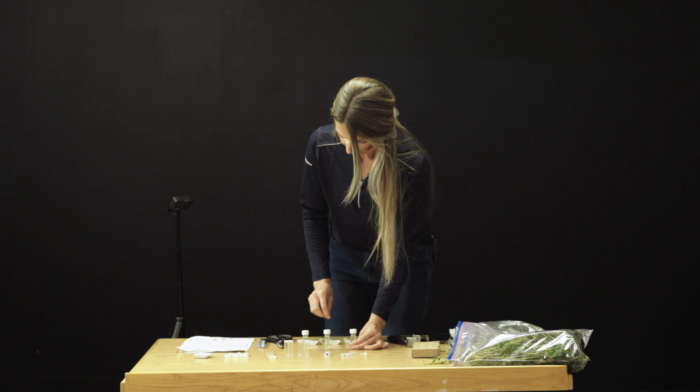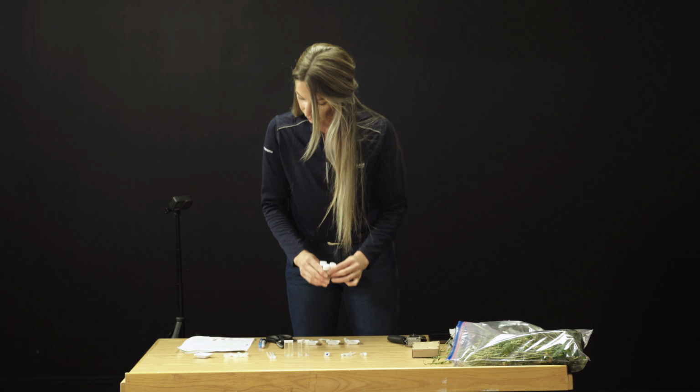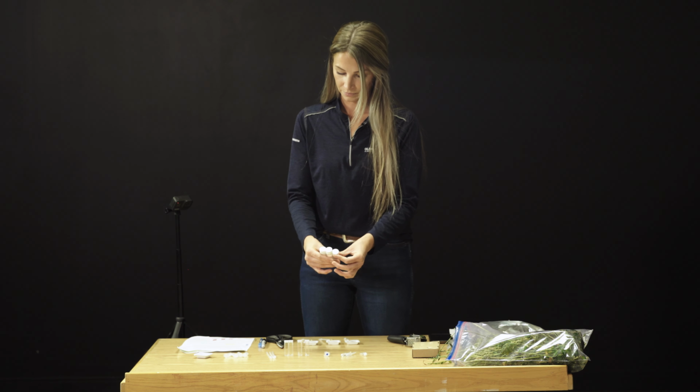Once you have done that, the pipettes and samples can then be discarded, and we will proceed to shake these tubes for approximately 1 minute.